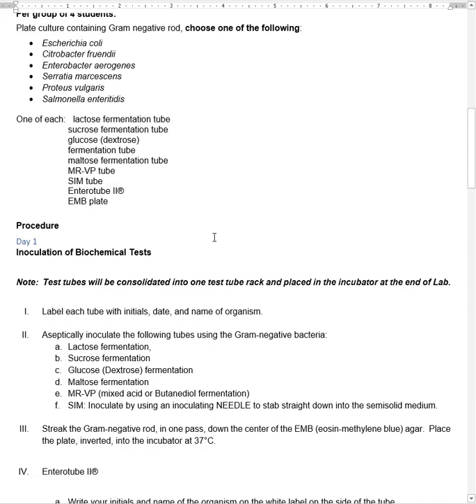You take a pipette and you take drops from the BP tube, put it in a clean test tube, and then you put the methyl red in there. And again, if it turns red, it's positive. And here's something that you might want to remember. If it's positive on methyl red, it's going to be negative for Voges-Proskauer.